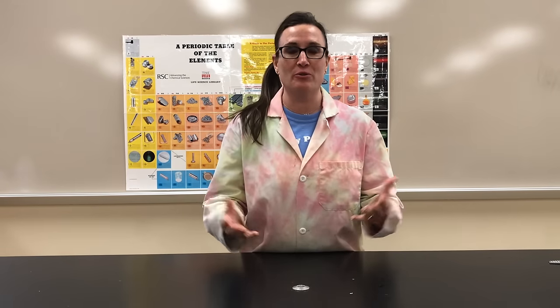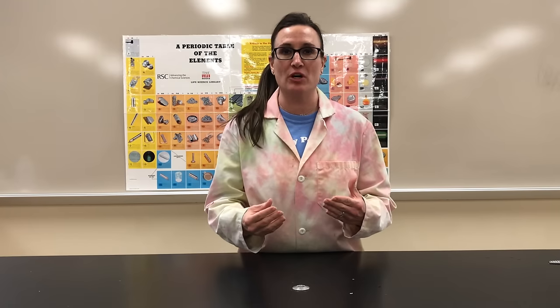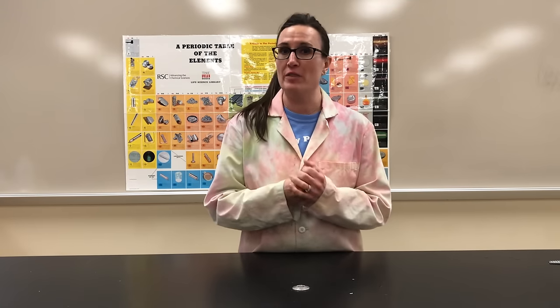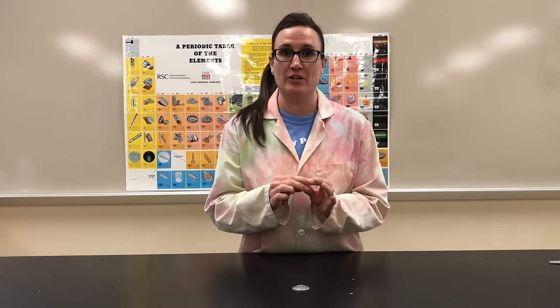In this video, what I'm going to go through is how to do a titration and also the calculations that are involved in a common titration. The one that I'm going to do is between sodium hydroxide and acetic acid in vinegar.